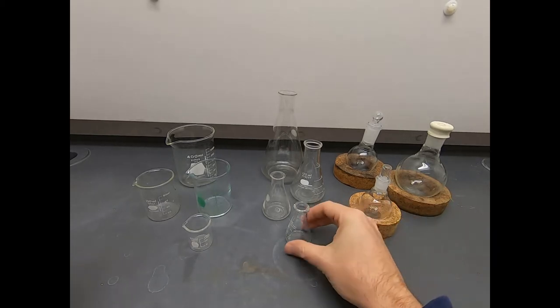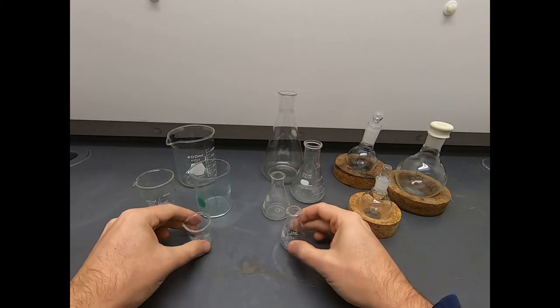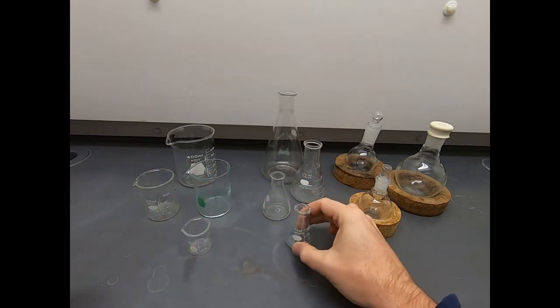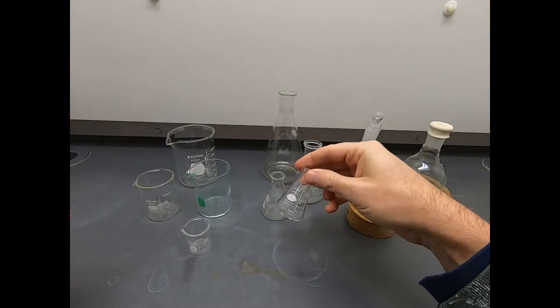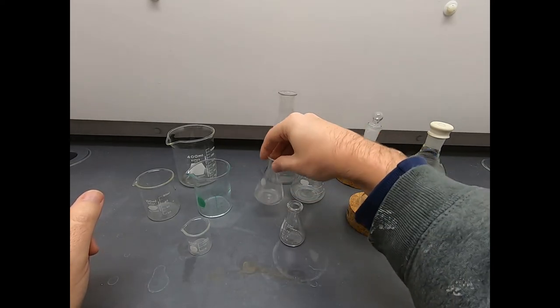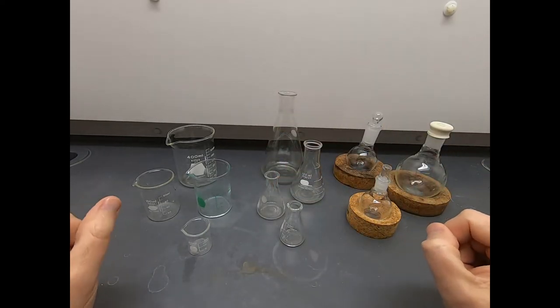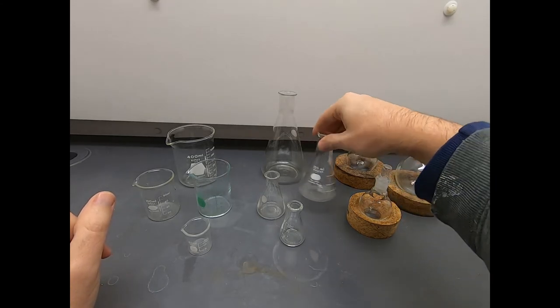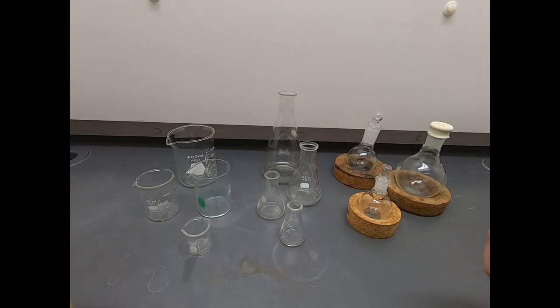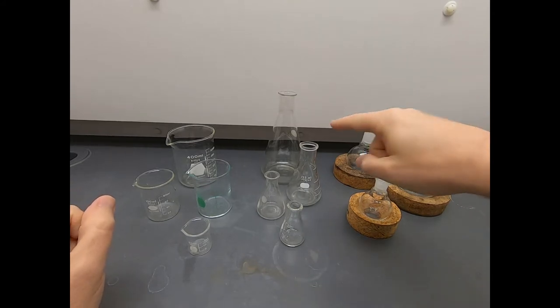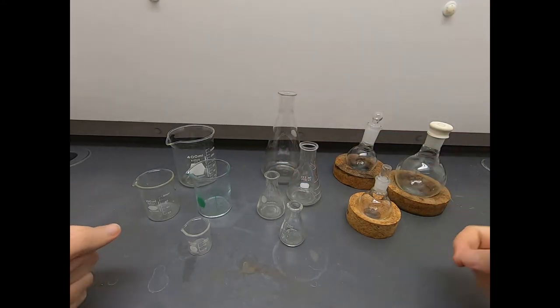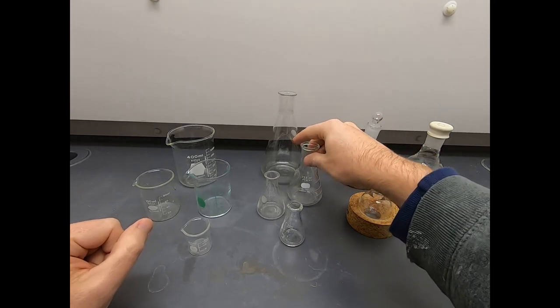In the middle of the screen, we have the Erlenmeyer flasks. Erlenmeyer flasks are different from a beaker. They have this conical shape, and these are particularly good if you have something that you're going to need to swirl around. The slanted sides help keep the contents in place. They're also good because if you're going to heat something up and don't want evaporation, it has a smaller surface area of exposure at the top, so there'll be less evaporation.